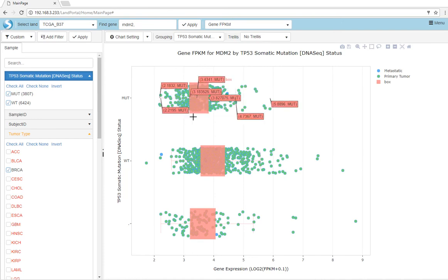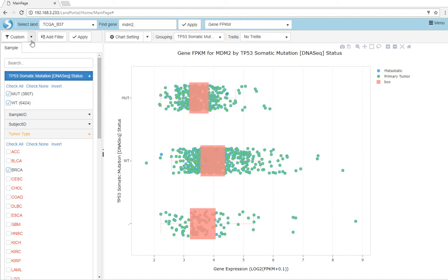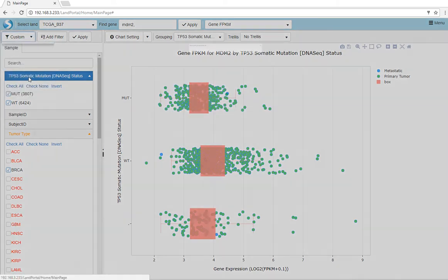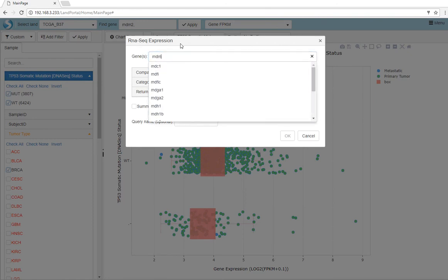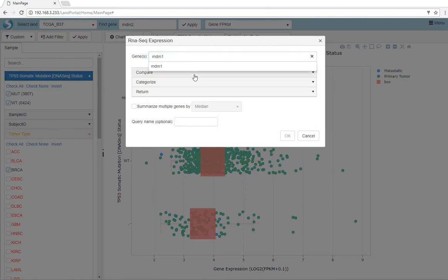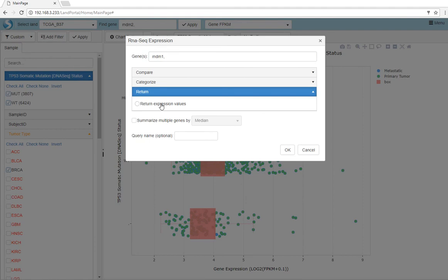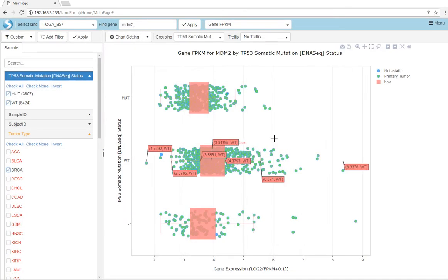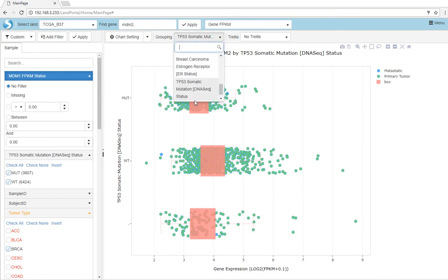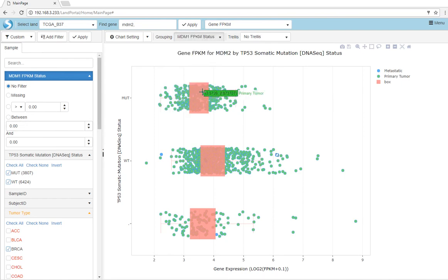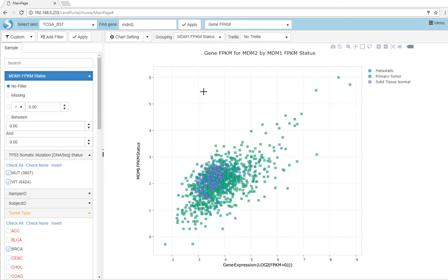To see how expression correlates between two genes, we can create a custom query for RNA-seq expression. Let's look at how MDM1 expression correlates with MDM2 expression. We will add an MDM1 query and use this query to group our MDM2 expression. We can see that MDM2 and MDM1 have a nice positive correlation in expression status.